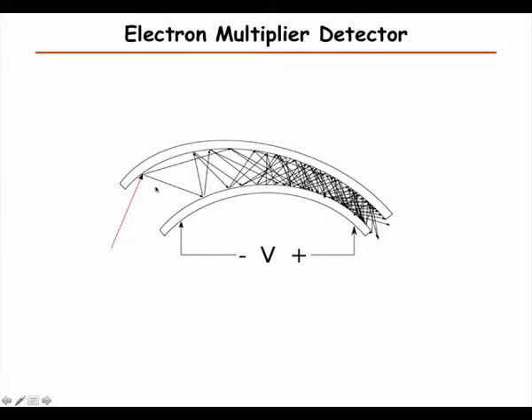for every particle that comes in. The things to consider when making these is, first of all, you want them to recover fast so that you can measure many different things. So what people have done is to have many of these channels in a small area.